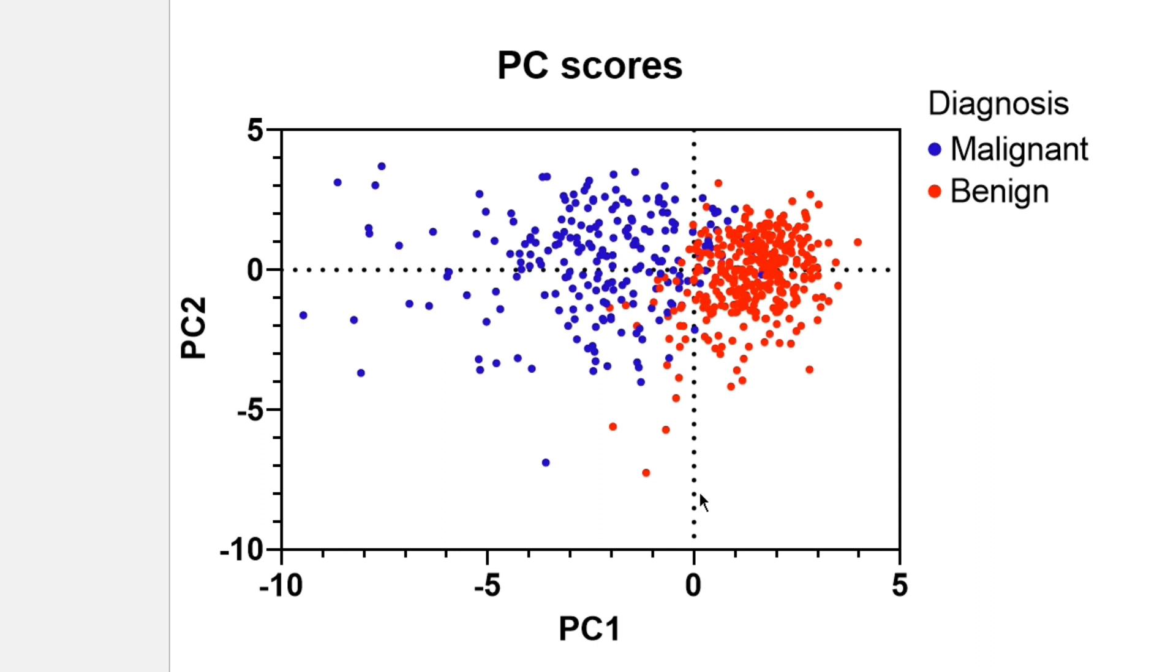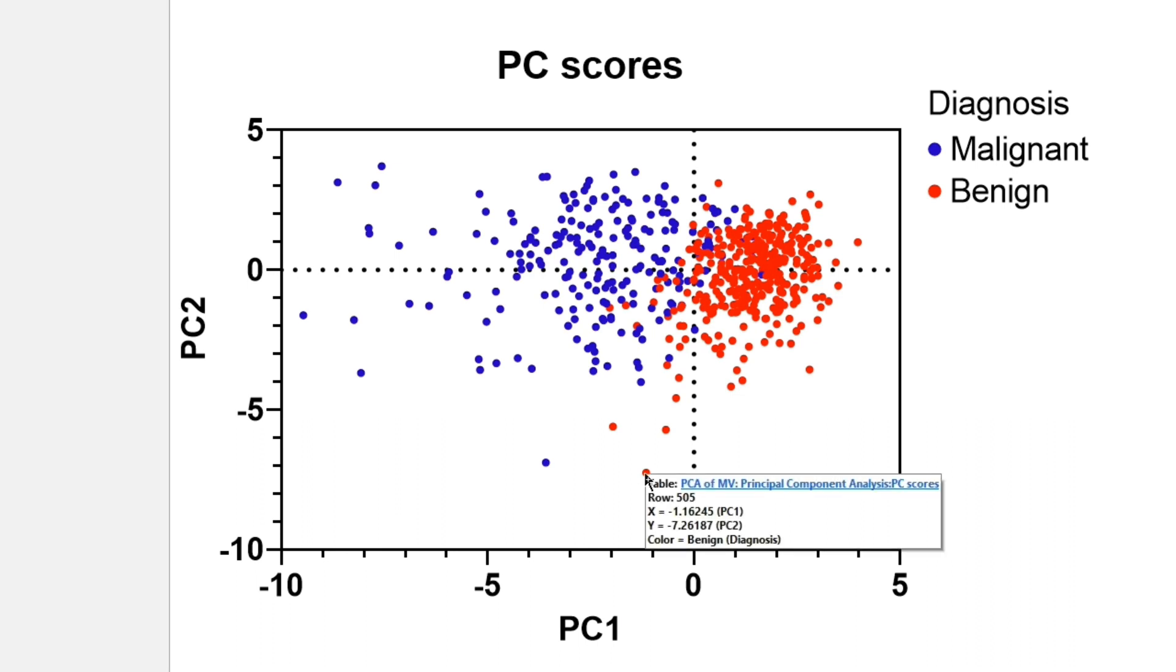PCA can help you find outlying points with unusual behavior. In PRISM, if there's a specific data point of interest, you can hover over it with your mouse pointer to get detailed information and a link back to the row or column of the original data table.